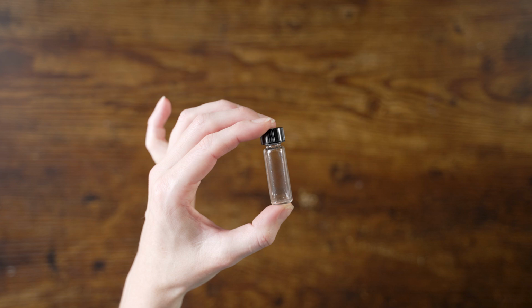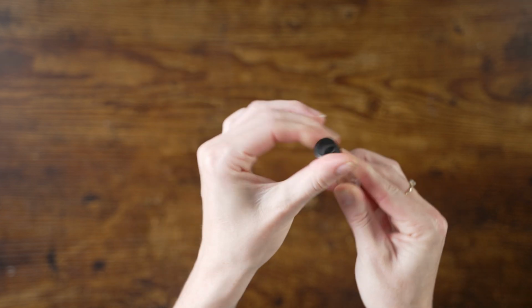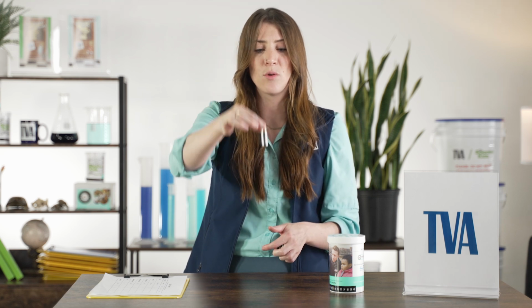Also, we have a glass vial. This glass vial is for our dissolved oxygen test. If you take the top off of your vial, you should see these rings on the opening right here. This is called the neck. When I give you instructions, I will tell you to hold it by the neck, and that's how we'll do our tests, holding it by the neck.